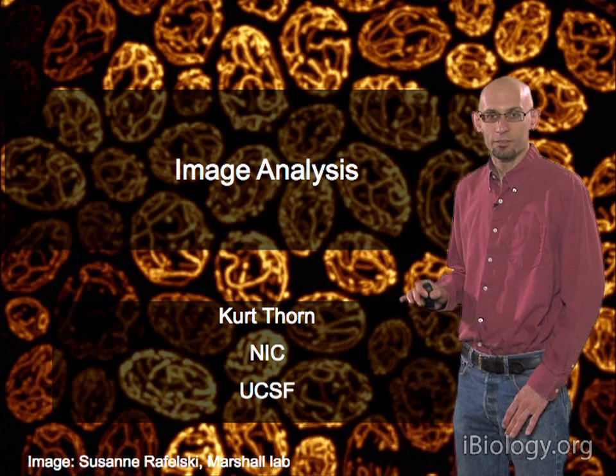And in general, this is something you probably want to do on your images if you're trying to do very quantitative imaging, or if you're doing things like image stitching or tiled images where you want to make sure that they don't have any checkerboarding, they have a very uniform intensity across the field of view. But in general, this is a good procedure to do. And almost any software package should be able to do this kind of simple image math where you're subtracting one image from another image or dividing one image by another image.